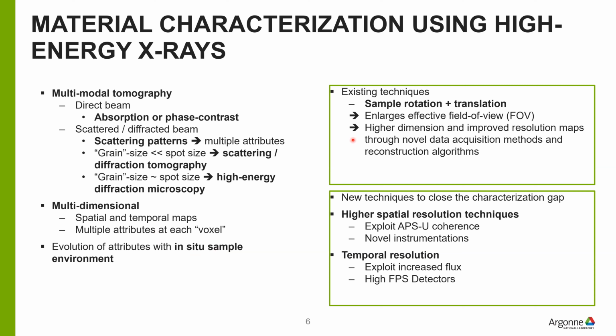So for existing techniques, we mainly focus on sample rotation and translation. This has two effects. One, it enlarges the effective field of view, and I'll get to that, and that'll be a common thing that I'll talk about throughout the talk. And also, we'll be able to interrogate higher dimensional and improved resolution maps through reconstruction algorithms.